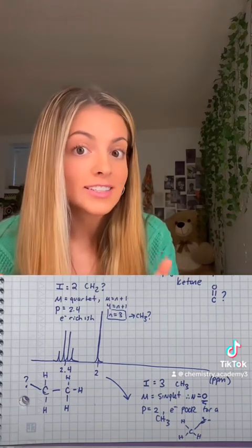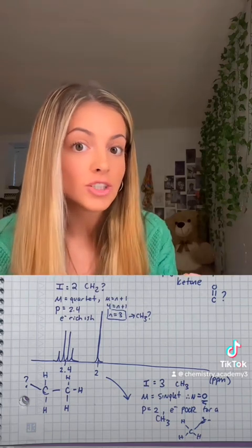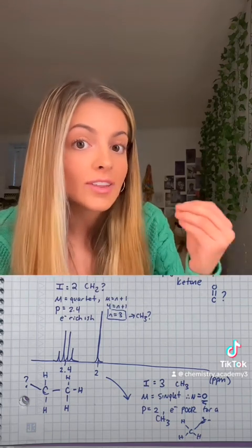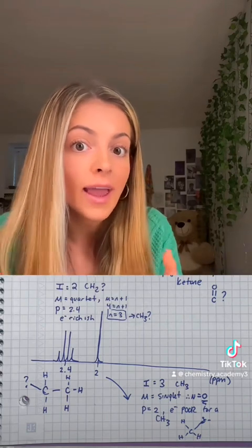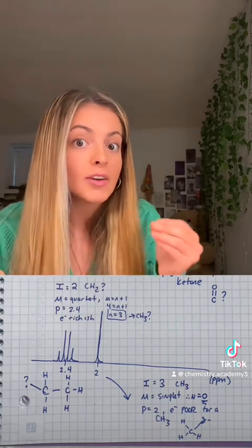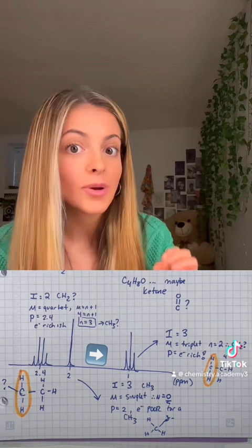So this is diagnostic, if you have a formula sheet, of a CH3 group connected to maybe a quaternary carbon with a ketone group on it, or something electronegative, but we know there's no halogens in our structure, so that's why I'm inferring that it's connected to the ketone. Now for our final peak, at 1 ppm we have a triplet with an integration of 3.